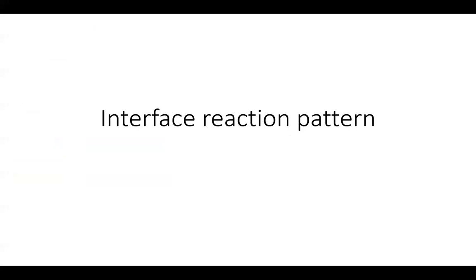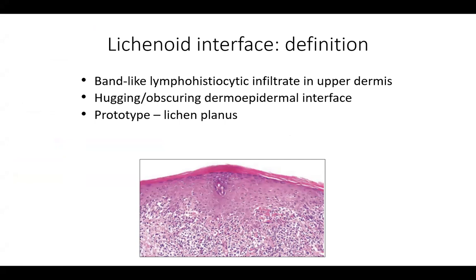We are going to discuss the interface reaction pattern. We'll start with lichenoid interface. The definition involves a band-like lymphohistiocytic infiltrate in the upper dermis. In the lower image, you can see this dense lymphocytic band-like inflammation obscuring the dermal-epidermal junction, with some areas of vacuolar change, which you often get with lichenoid inflammation.